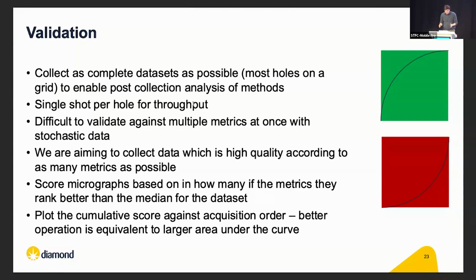And then we effectively have a data set that's run through the processing pipeline. We have the metrics that would be returned for each of the micrographs we have in the data set, and then you can iterate against that. You have these sort of complete data sets that you can just feed through the system and see how you perform.